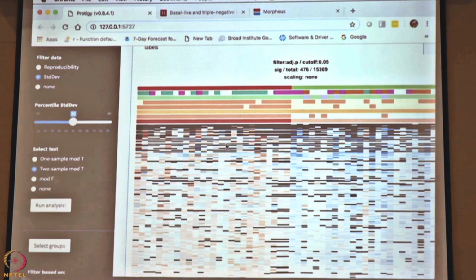But if your conclusion is made on two samples in one group and one sample in another group with all the rest missing, that's not what you want. So by visually exploring your data, you can get a feel for what is happening, whether your analysis is reasonable or not, and you can constantly keep making sanity and quality checks to make sure that the results you are getting are reliable.